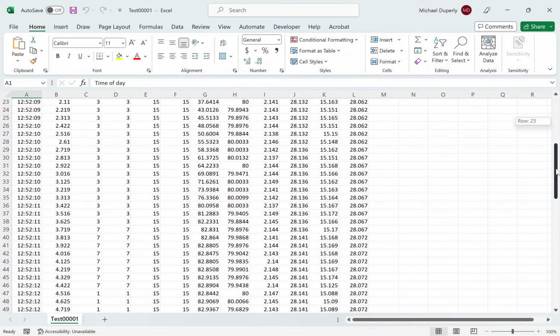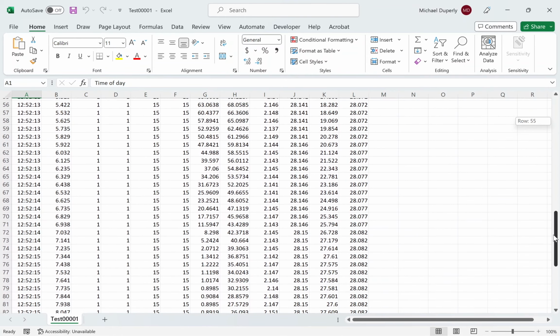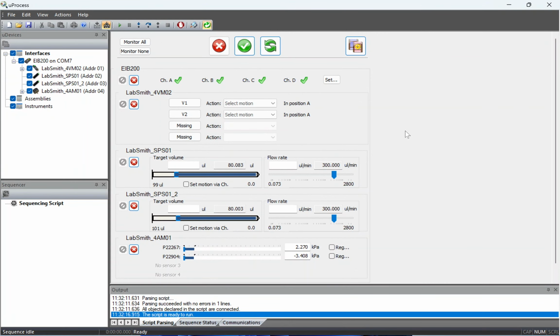Logs are useful for analyzing the readings of individual uDevices, tracking their changes over time, comparing data from several different uDevices simultaneously, and logging experimental parameters. Since different uDevices collect different data, your data log will depend on which uDevices are connected.